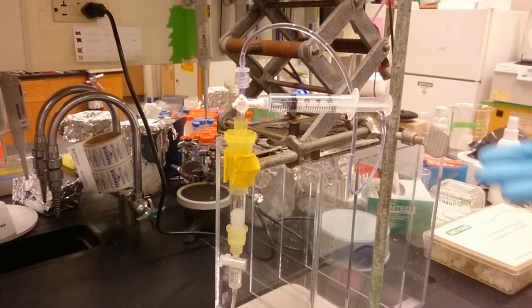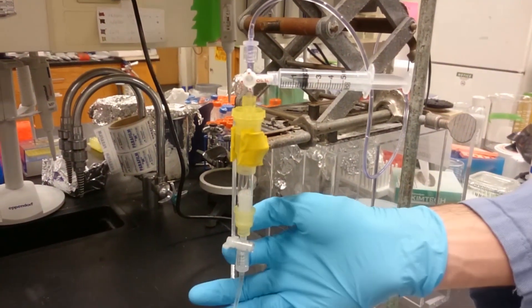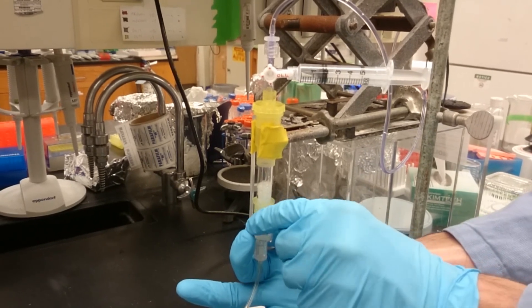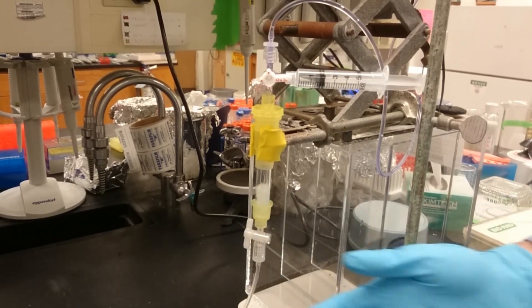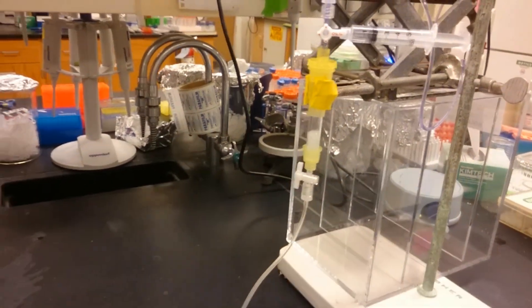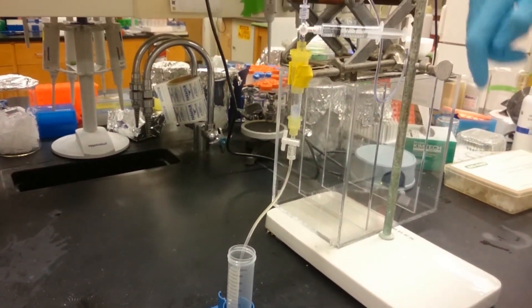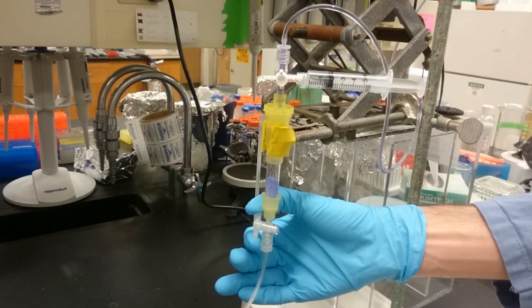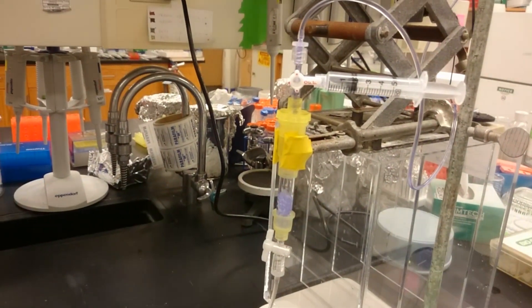Right now you don't see anything happening, and that's because the bottom stopcock is closed. Once I open this, you'll see that it'll start to flow and we'll get a nice constant drip.